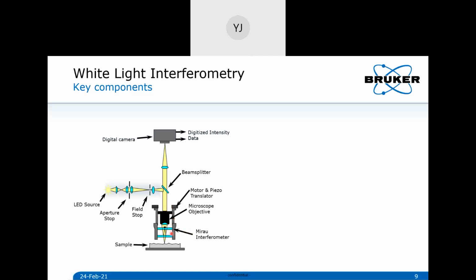Once you have the calibrated objective from us, and you also calibrate it at the time of installation, this should hold for several years, but you can get certified calibration samples to periodically check. In case you see something moving or changing, you can recalibrate it on site, and this can be done pretty simply. I would recommend a calibration check once every 6 months. That should be sufficient.